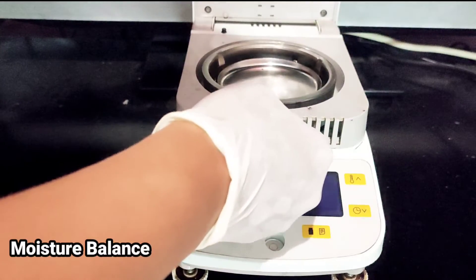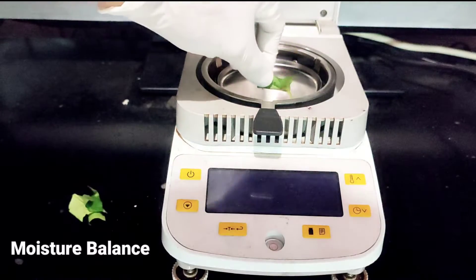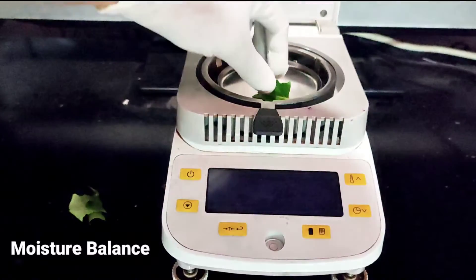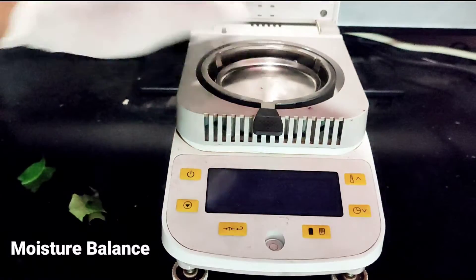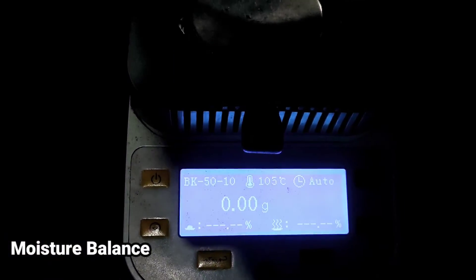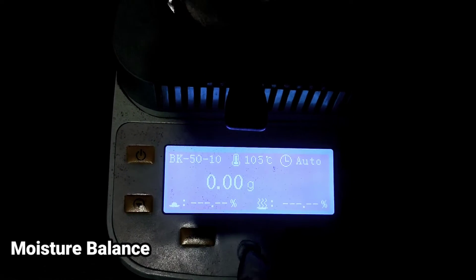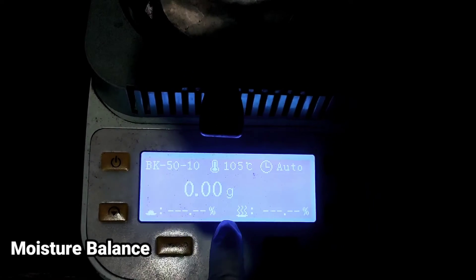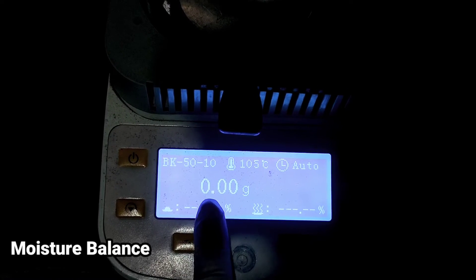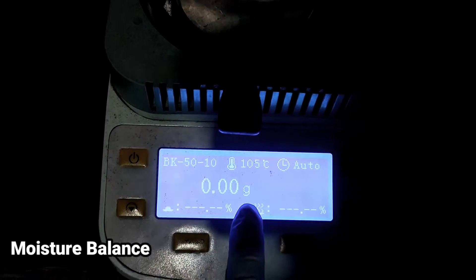Yang utama, kita masukkan sample yang mau dipanaskan. Terlebih dahulu kita hidupkan power. Setelah muncul, hidupkan power — ini tampilannya masih posisi belum ada sample, jadi untuk pengukurannya belum ada.